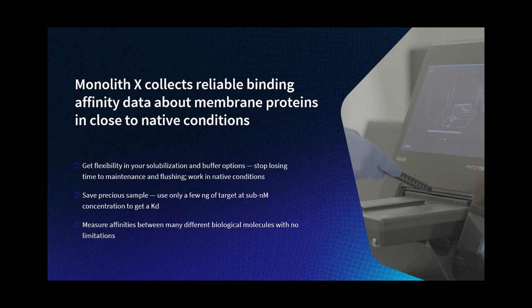It's quite straightforward with the optimization because it's a soluble system, and a lot of these issues with binding protein to a chip, you don't have. You can work in solution. You have to label one of the partners, either your target or your ligand, with a red dye. We have a very well-established protocol. We basically just used NanoTemper's protocol and tweaked it a little bit, so it works very nicely in our hands. So this could be quickly adapted.